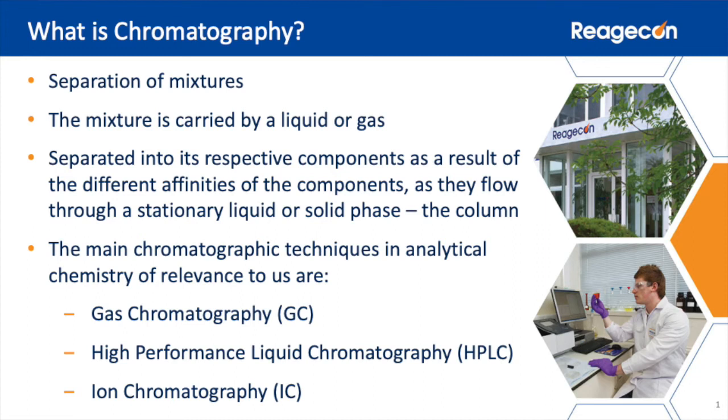Three of the main techniques of analytical chromatography analysis are gas chromatography, high-performance liquid chromatography, and ion chromatography. So to define chromatography in simple terms, it is the separation of compounds based on their affinity for a bonded stationary phase. Of course, there are several other forms of chromatography. Of particular interest in the life sciences and biological fields are gel filtration, ion exchange, and affinity chromatography. However, the basic principles remain the same for all of these.